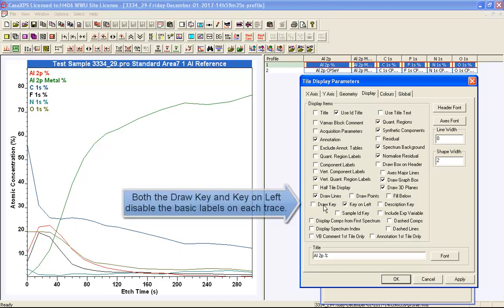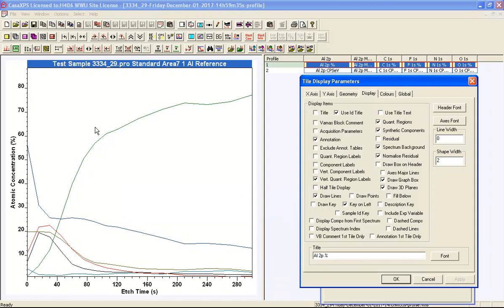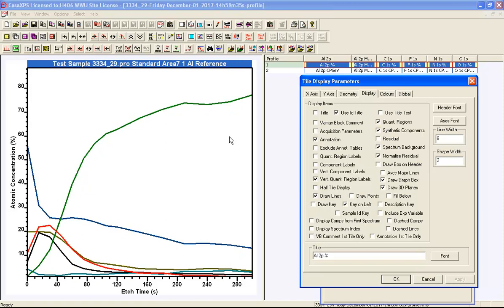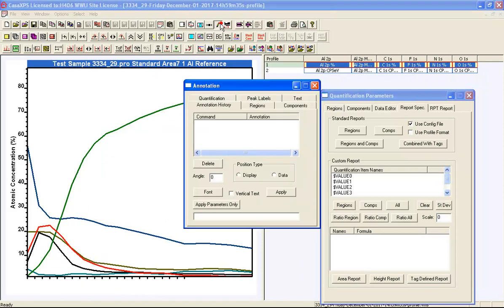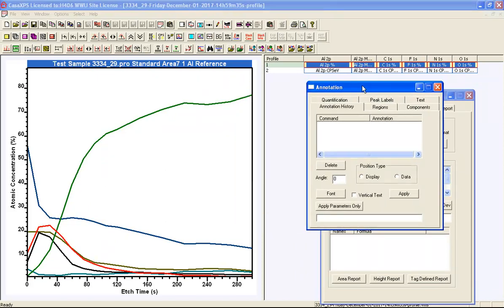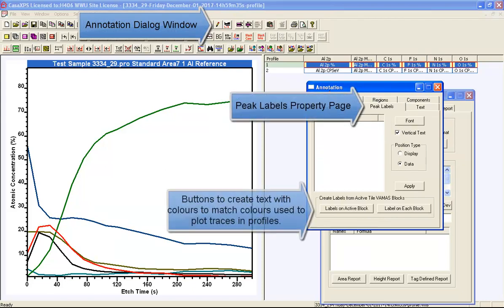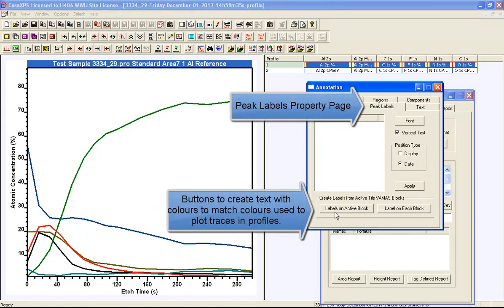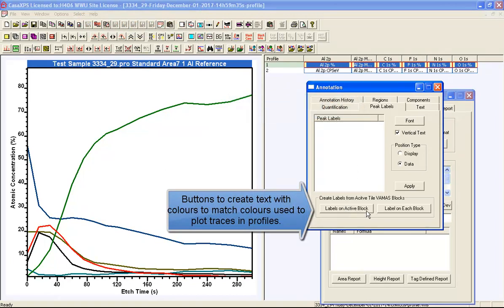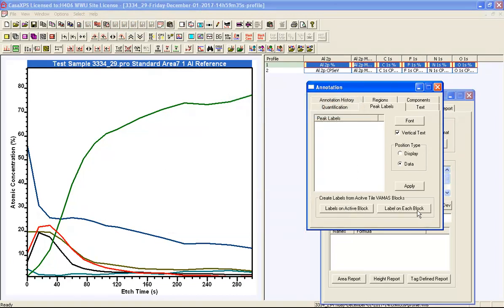If you untick 'Draw Key' but leave 'Key on Left' ticked, the display shows no labels whatsoever. You can also adjust the line width to give the traces a bit more thickness. Having done that, we'll now look at how to label these in a custom way using the peak labels property page on the annotation dialog window, where two buttons — 'Label on Active Block' and 'Label on Each Block' — offer slightly different functions.